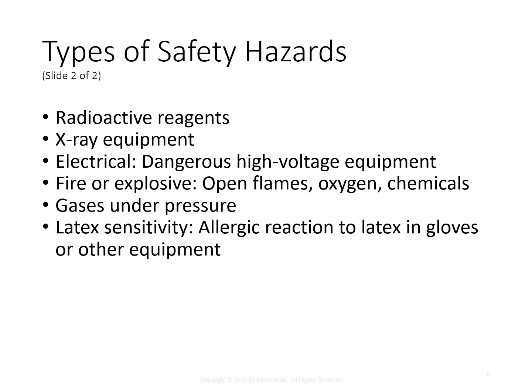You may also run into radioactive reagents, X-ray equipment, and electrical hazards. There is some high voltage equipment that is used in the lab. You have fire or explosive hazards as well, so open flames can be used sometimes, oxygen and chemicals. There are also gases sometimes under pressure, like in the big tanks. And then there's also latex sensitivity. Some people actually have an allergic reaction to latex that can be found in gloves or tourniquets.